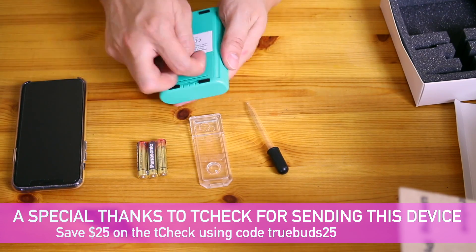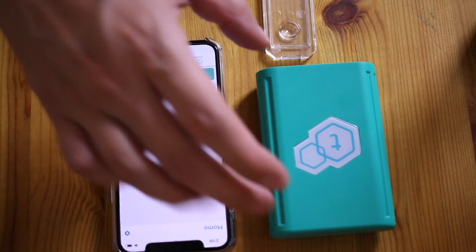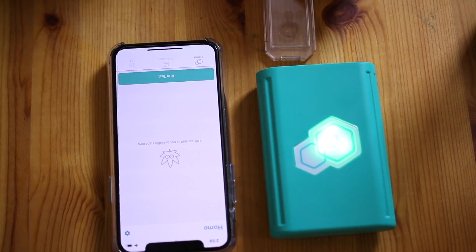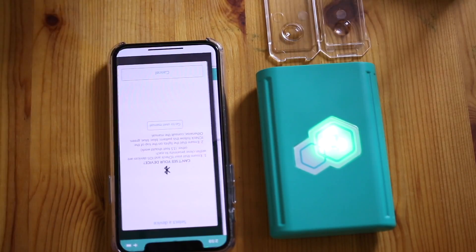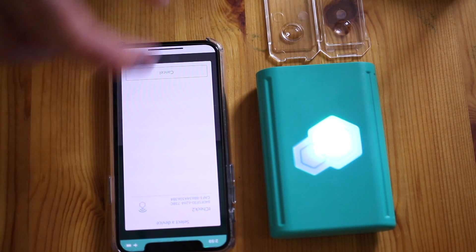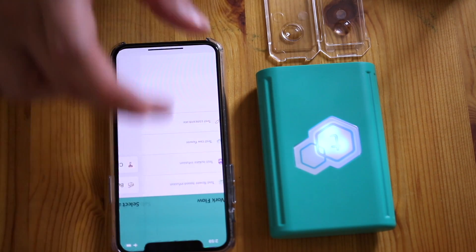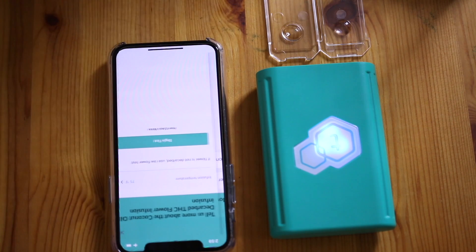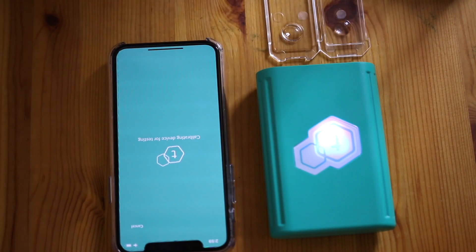Let's go ahead and put these batteries in and do a real-time test of this oil I have. Make sure you have the app on and your Bluetooth on. Turn on the T-Check 2, open the slide up, run test. It'll take a second to connect to the Bluetooth. When you see the device, connect to the T-Check 2. It is now connecting and we're going to decide what we're testing — some coconut oil here today. You set the temperature; it's about 75 degrees in here, the temperature of the oil itself. The T-Check 2 is now calibrating, getting ready.